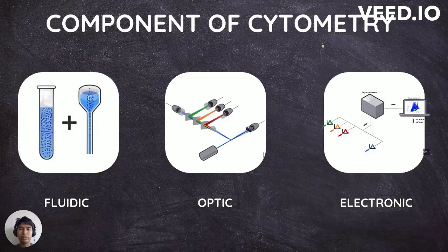The components of a cytometer are divided into three parts. The first one is the fluidic, followed by the optical and electronic systems. The fluidic system of a flow cytometer is responsible for transporting the sample from the sample tube to the flow cell, while the components of the optical system include the excitation light sources, lenses, and filters used to collect and move light around the instrument, and the detection system that generates the photocurrent. The electronics are the brain of the cytometer. Here, the photocurrent from the detector is digitized and processed to be saved for subsequent analysis.